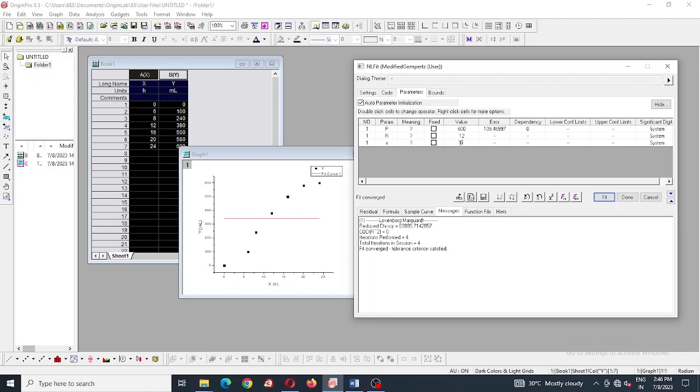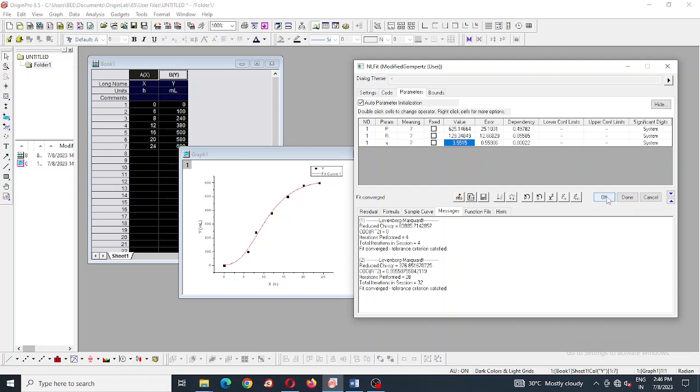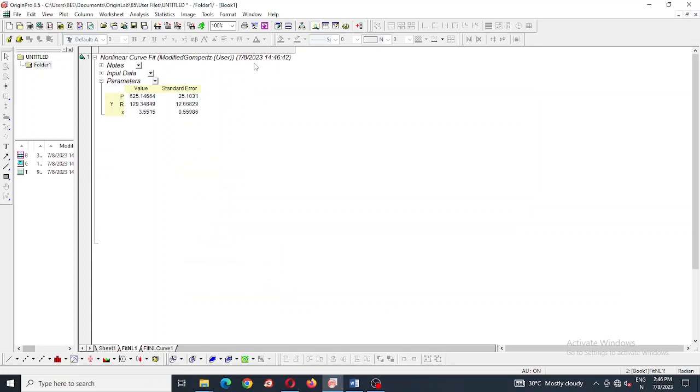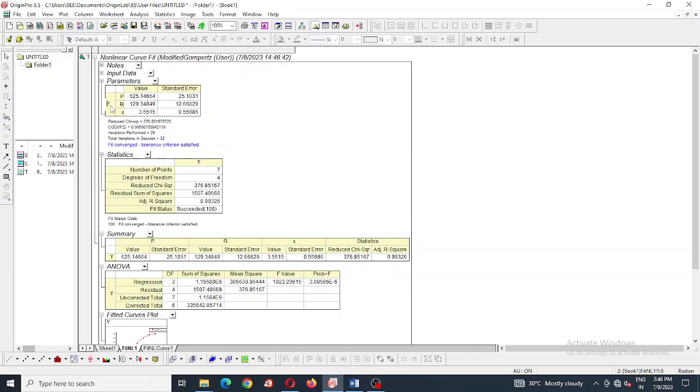And here is the curve fitting of Gompertz equation. Report will be generated, also you can see the graph. Here we are changing the report table for hydrogen production, we are just adding the names - hydrogen production for P, R for rate of production, and X for lag time.